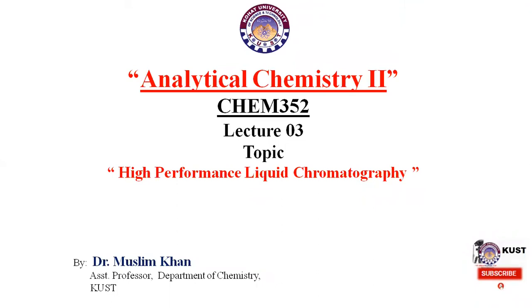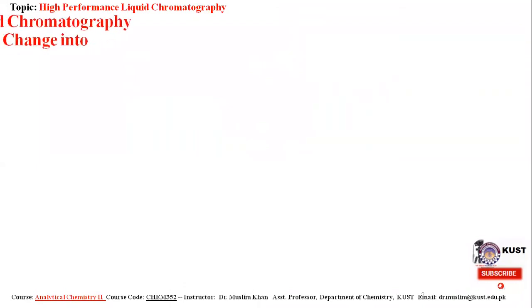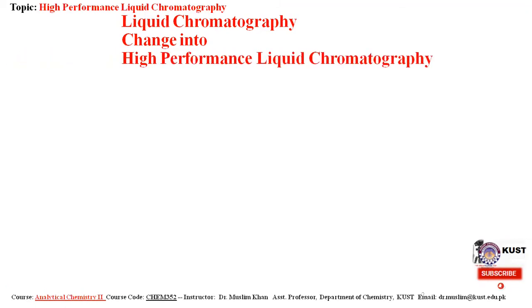Today the topic of our discussion is high performance liquid chromatography. In our previous lecture, we discussed different types of chromatography. And you remember this was the last slide, and we discussed how liquid chromatography changed into high performance liquid chromatography.